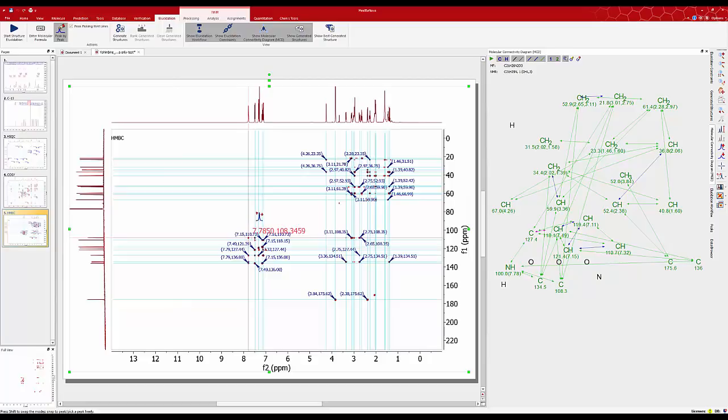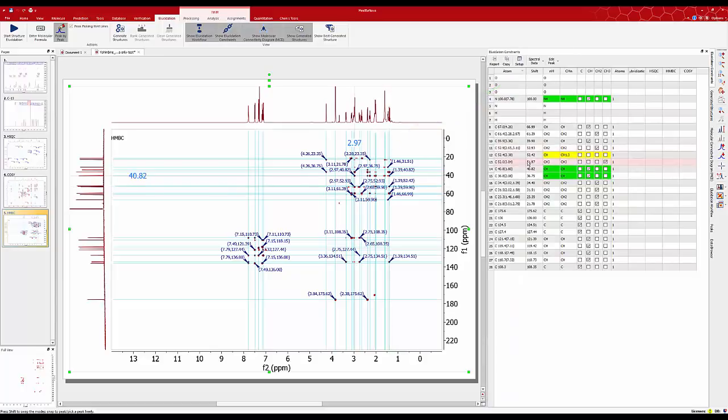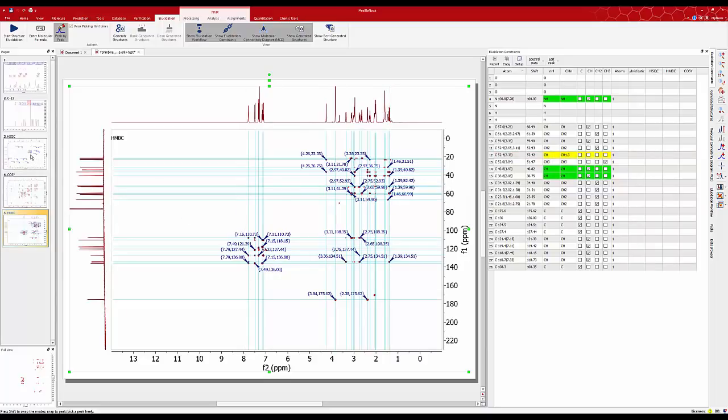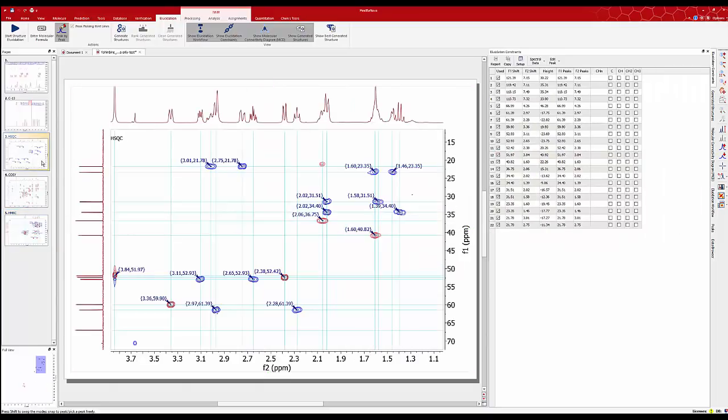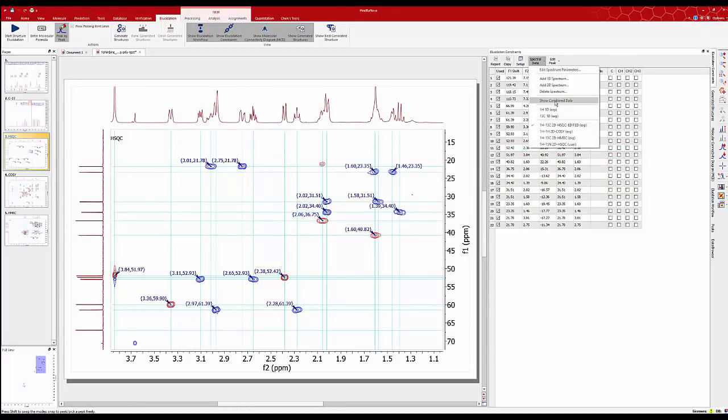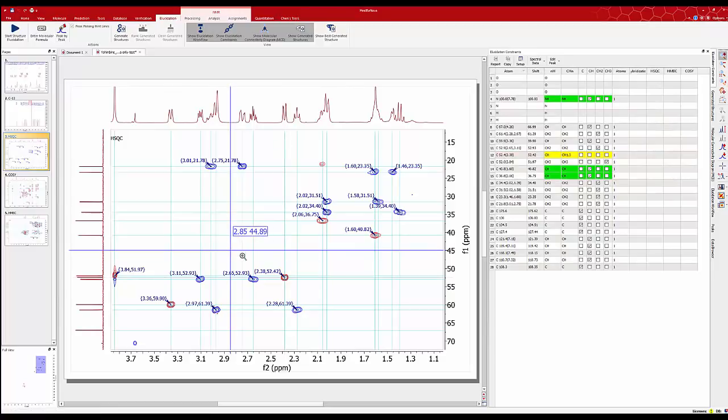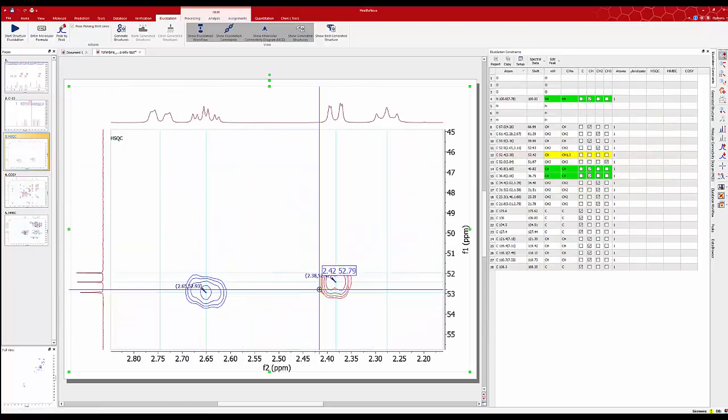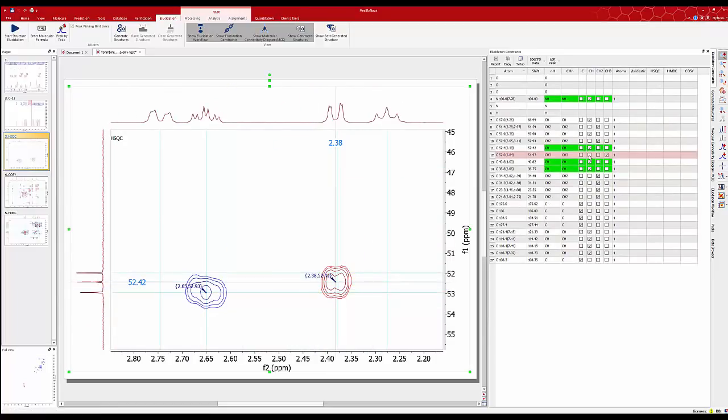Looking at the MCD we see an ambiguity between a CH or a CH3 that we have to resolve manually. For this just go to select show elucidation constraints. The yellow row disperse the ambiguity. Following the chemical shift we select the HSQC spectra to see that we have only one proton. We can select the right box and now we're ready to click on the structure generation.